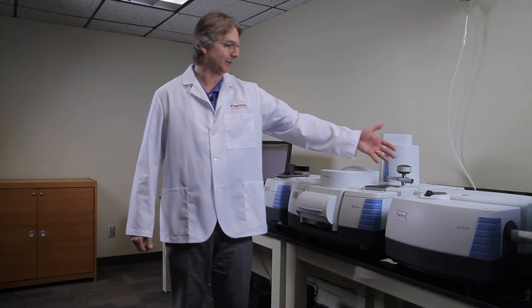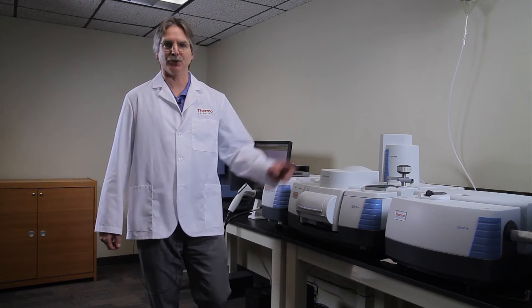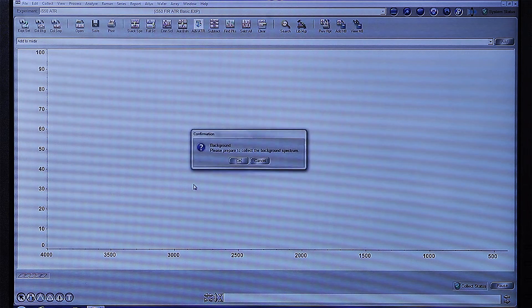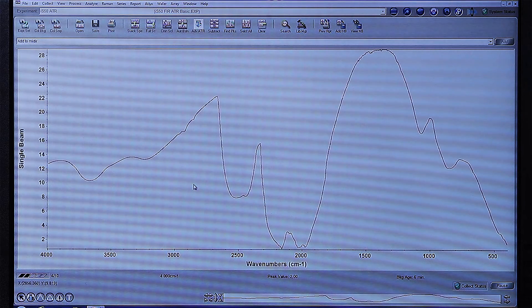Today we'll be looking specifically at the built-in ATR device. To collect mid-infrared data using the ATR, it's as easy as pushing the blue button to collect the spectrum. Pushing the blue button allows the accessory to collect a background. On the screen, we'll see a background show up, and once the background is collected, we'll be able to analyze our sample.